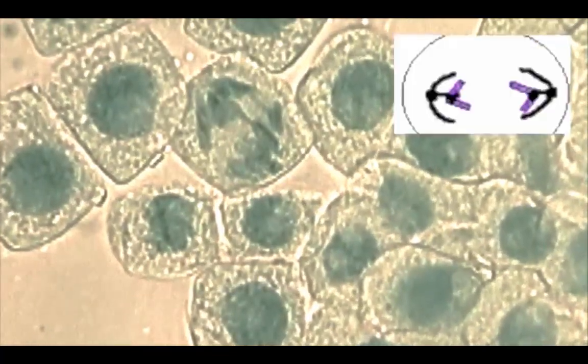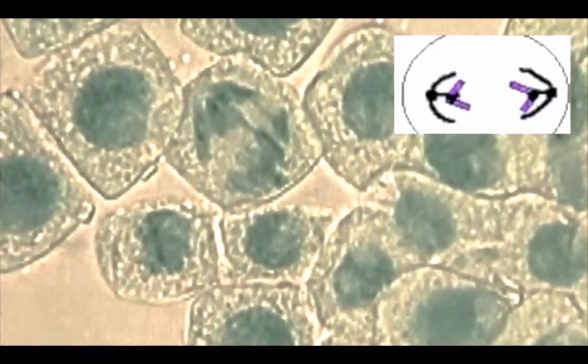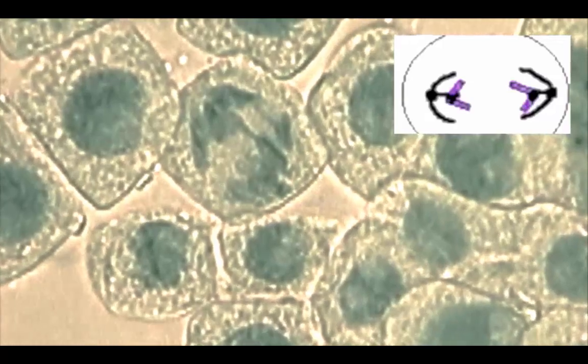The center cell here is clearly going through anaphase, where the sister chromatids are separated and moved to opposite poles of the cell.